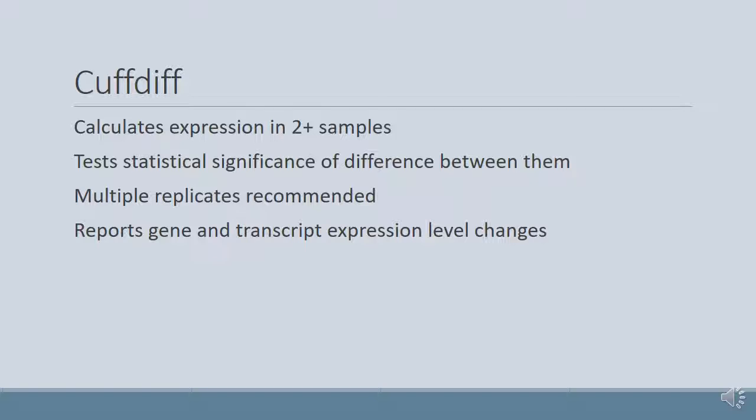It will report gene and transcript expression level changes, the p-value, fold change, and the name and location in the genome of the gene and transcript.